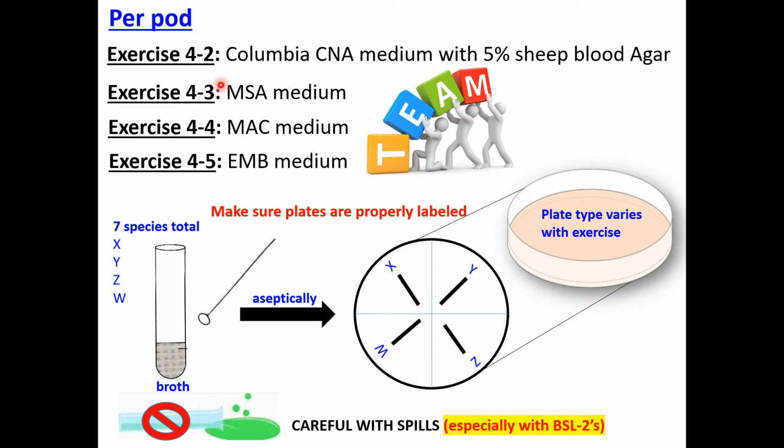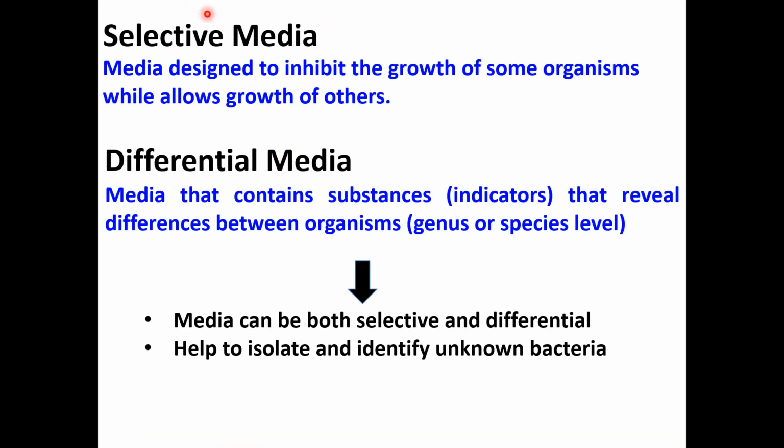The only thing about each medium is to understand what we are learning from the results. Okay, so interpretation is going to be everything. So all the media that we have today are selective and differential. When we have a selective medium, because they don't have to be both, they can be either one, okay? It just happened that we have both aspects, selective and differential, but you can have only selective media and only differential media.